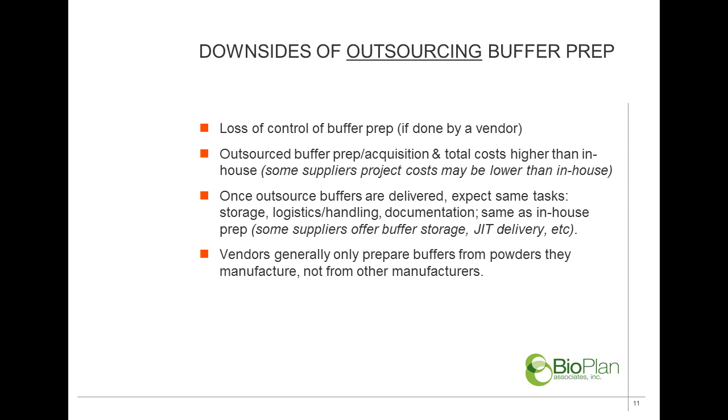The downsides, of course, and this is a major one, is the loss of control of buffer prep if that's done by a supplier. Obviously, in some situations that's a critical component, and as this industry moves more toward continuous bioprocessing, obviously that becomes an even more significant issue to consider. The logistics associated with the fluid management there. Outsourced buffer prep and acquisition total costs are higher than in-house.